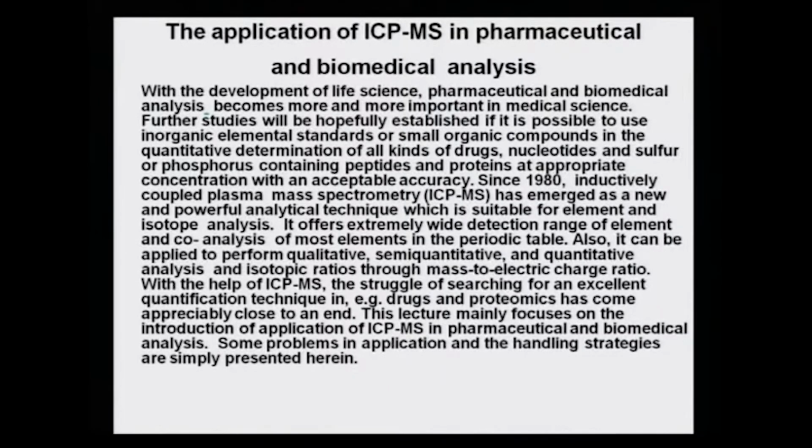It offers extremely wide detection range of elements and co-analysis of most elements in the periodic table. Also, it can be applied to perform qualitative, semi-quantitative and quantitative analysis and isotopic ratios through mass to electric charge ratio, that is with the help of the MS.